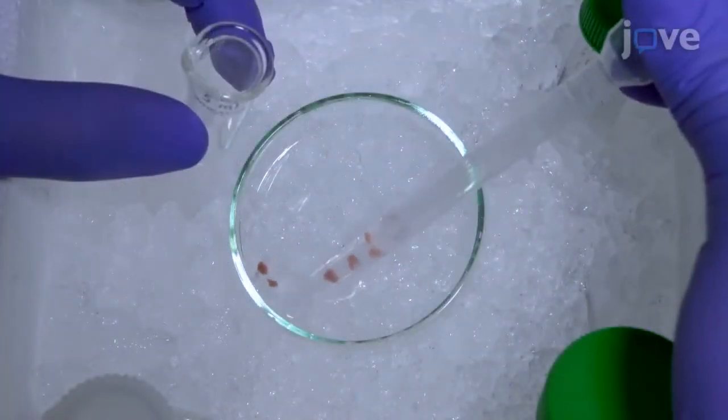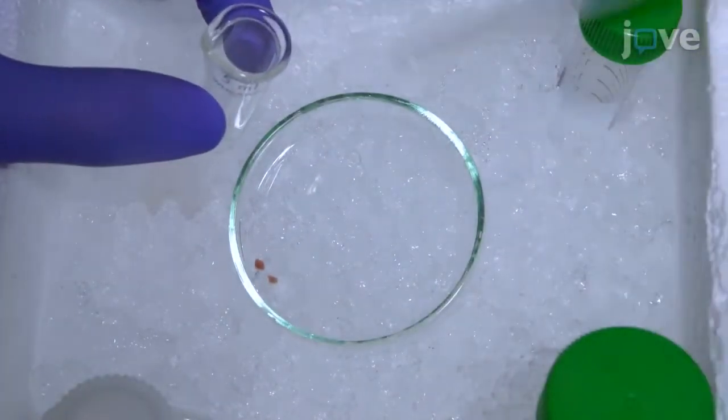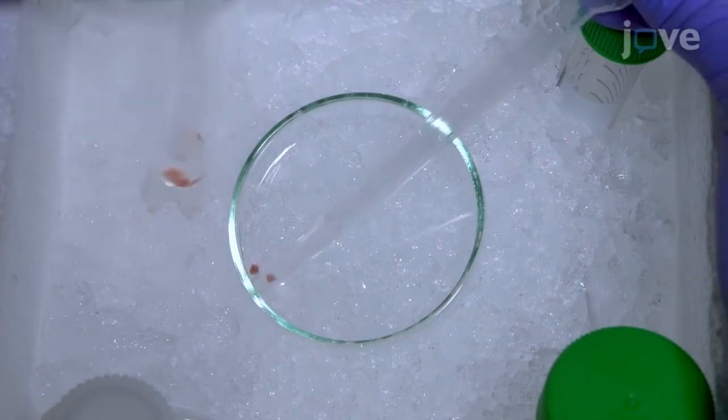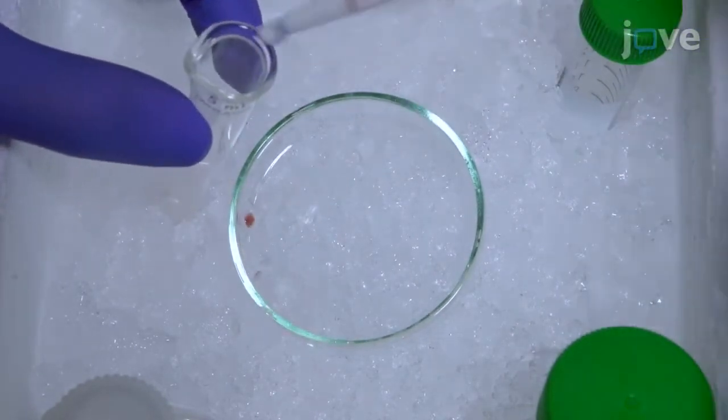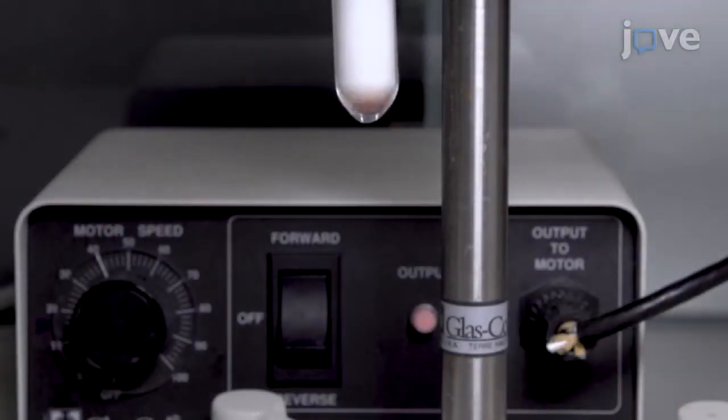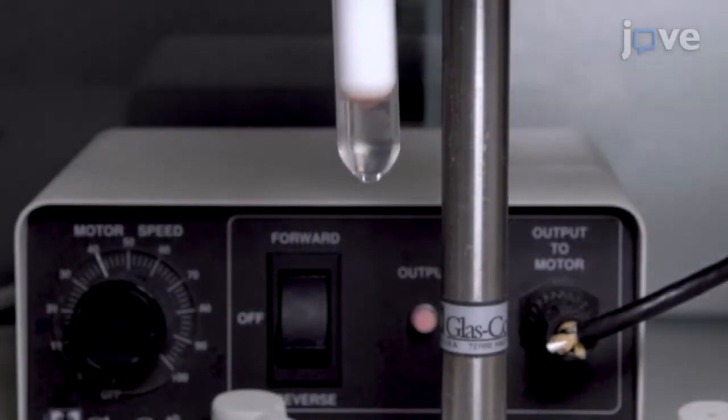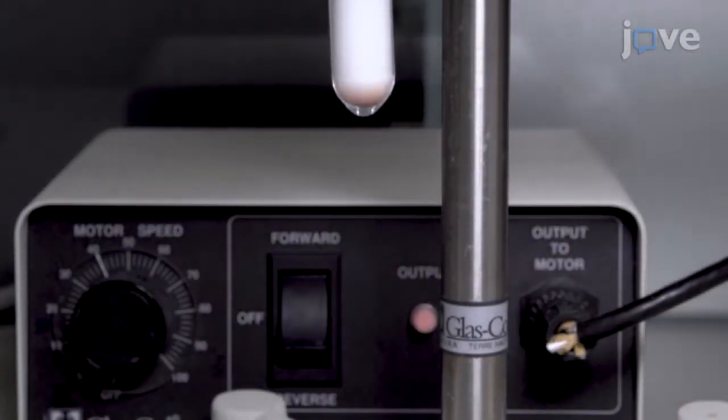When all of the tissue has been cut, use a cut pipette tip to transfer the entire volume of solution and tissue fragments into a Potter Elvihem glass and use a grinder to mechanically disrupt the tissue at 30 to 40 rotations per minute.